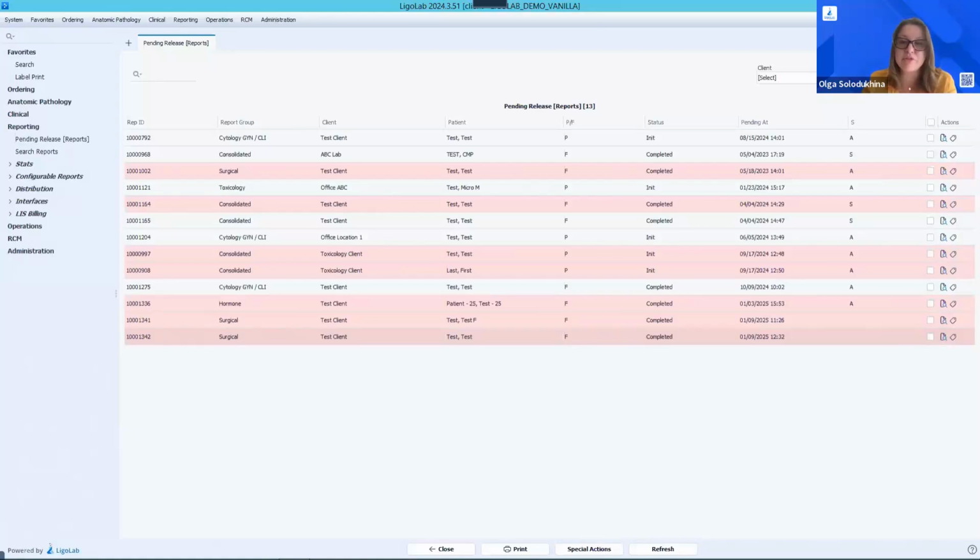I'm not sure if it refers to third world country clientele, but we are looking to expand our services to other countries. As I mentioned, we are built for mid-size and large-size labs. So if we're talking about some smaller labs in third world countries, probably we could be on their more expensive side.